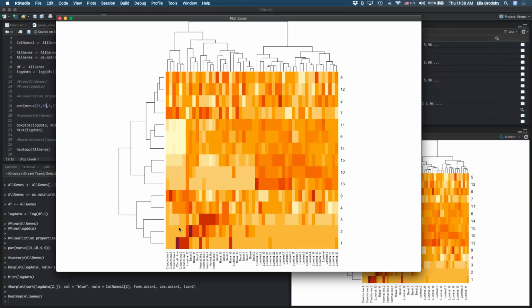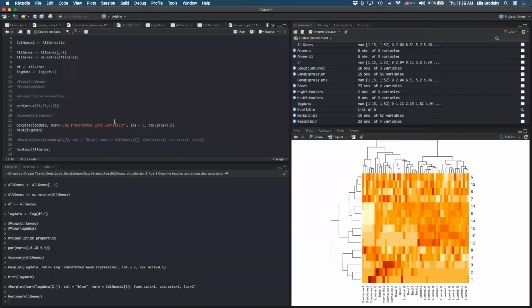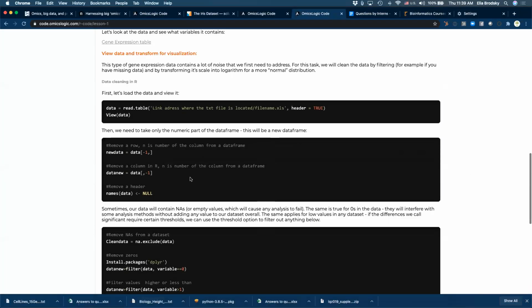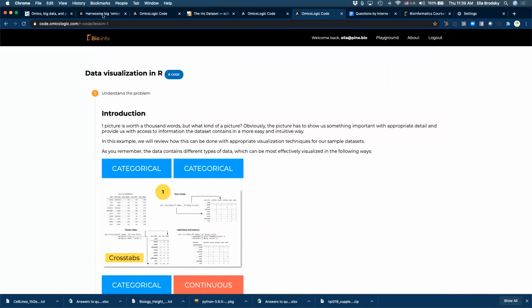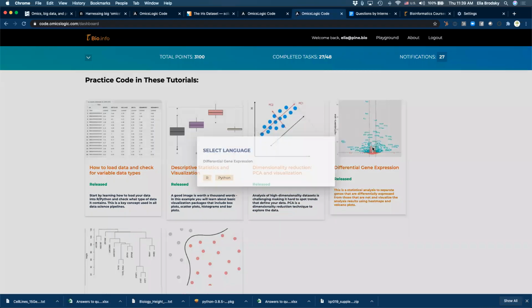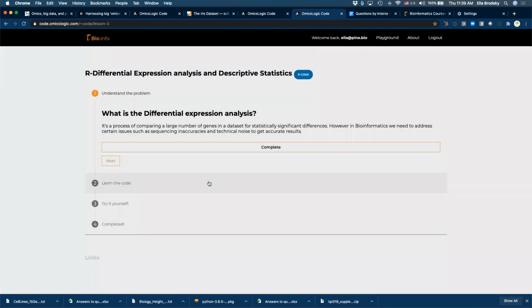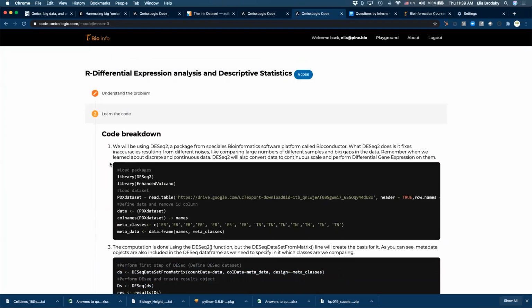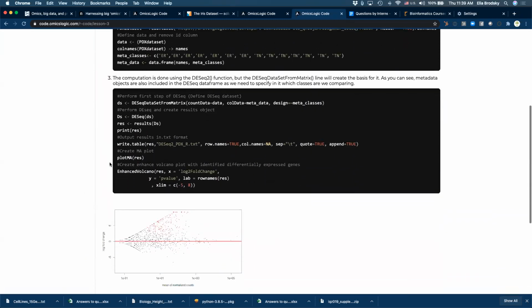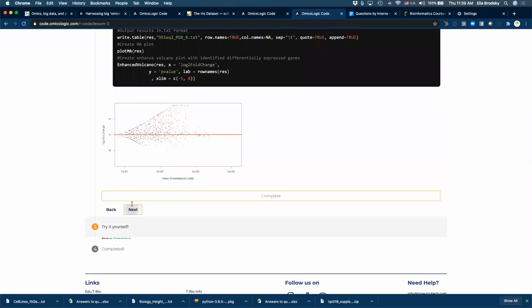As you're waiting on your pipeline, you might not be able to complete your assignment in Transcriptomics 1, so start working on Transcriptomics 2. On the code platform, you can complete data visualization, but also you can do differential gene expression. Differential gene expression allows us to apply some statistics to find differences between two groups of samples.